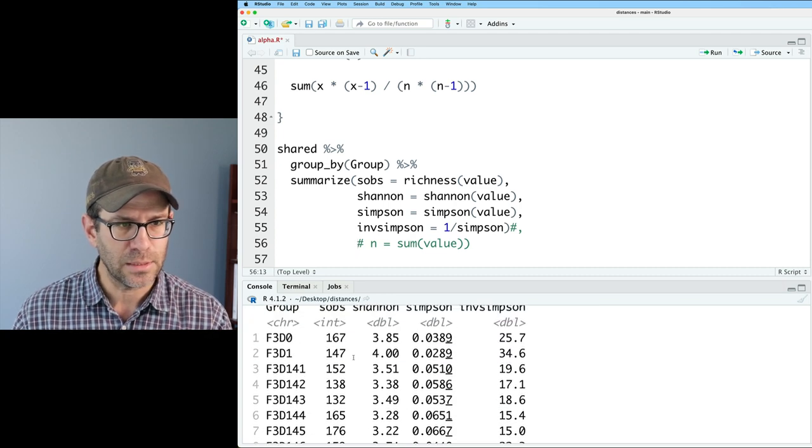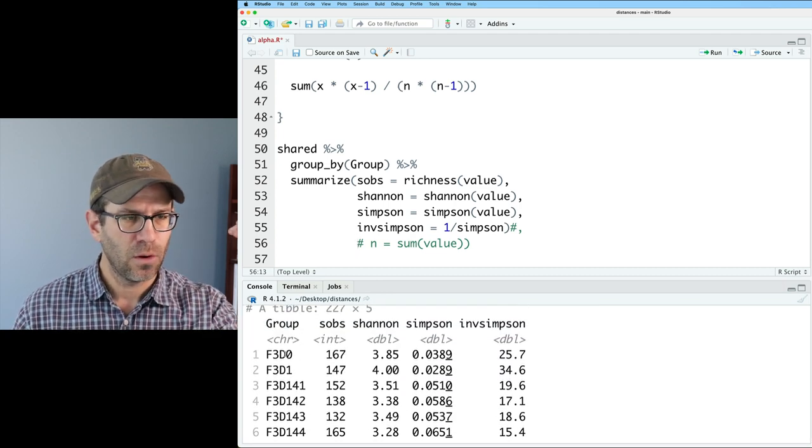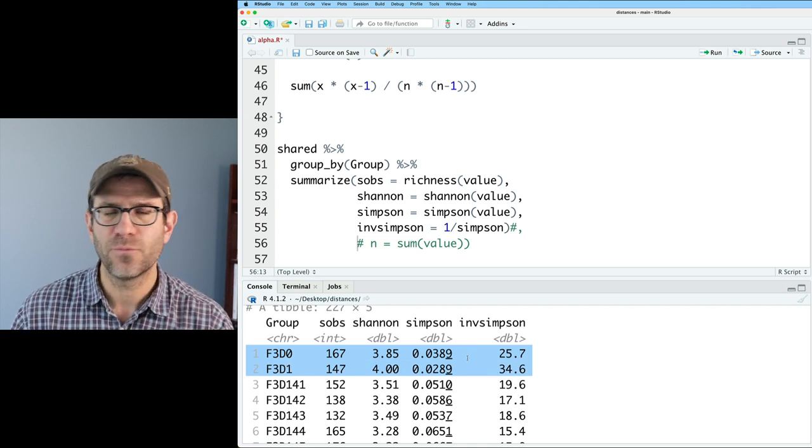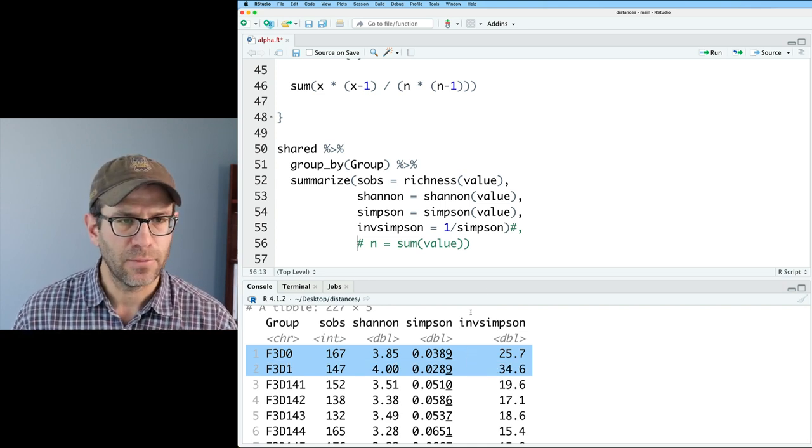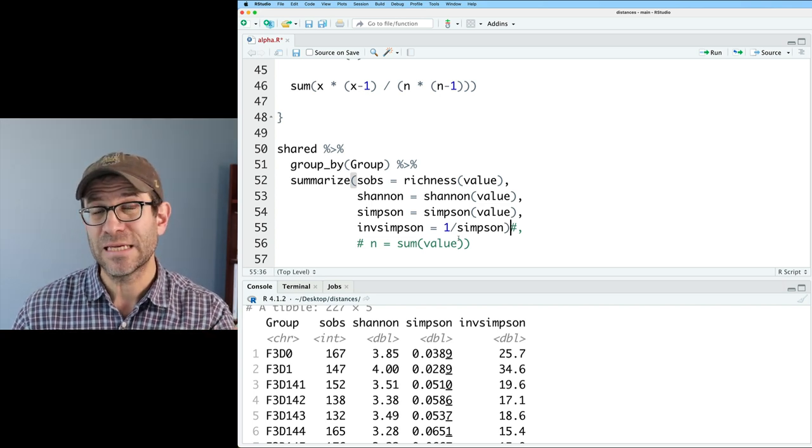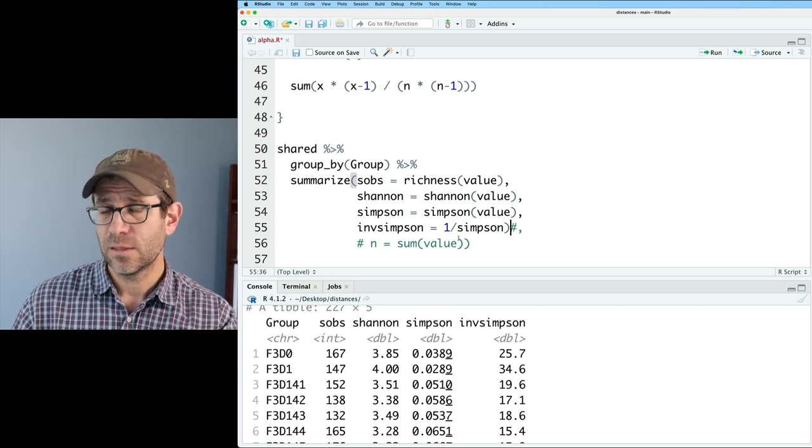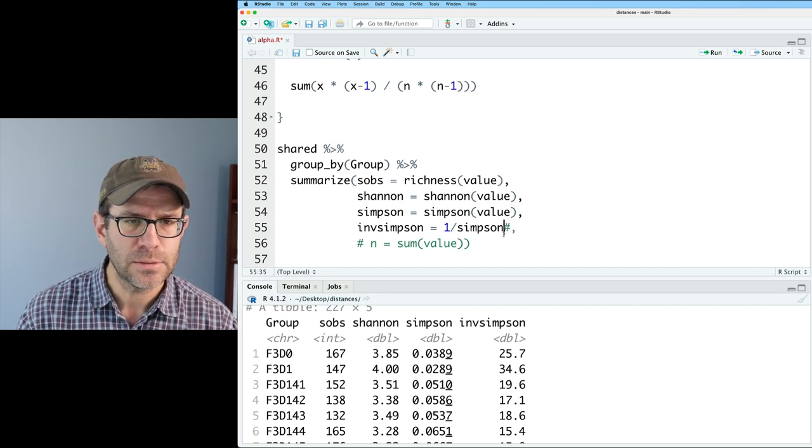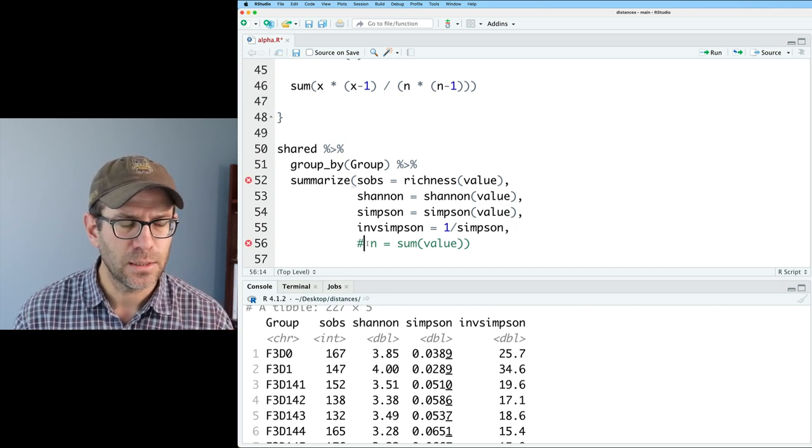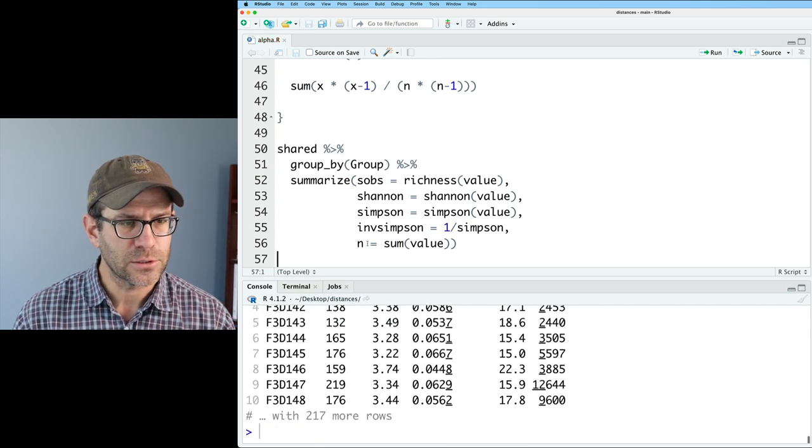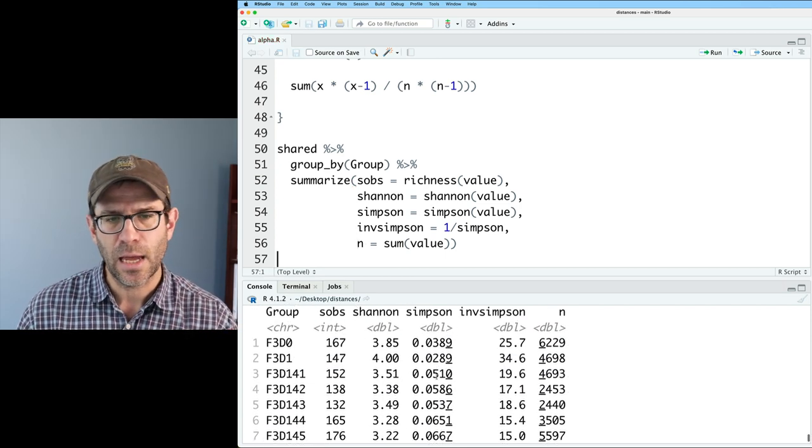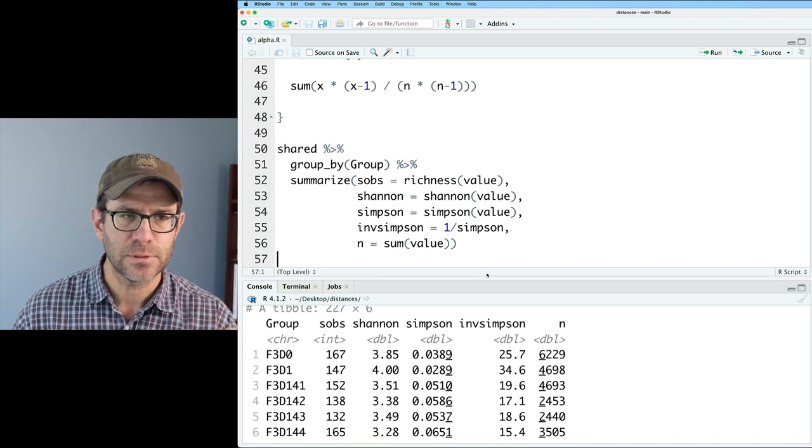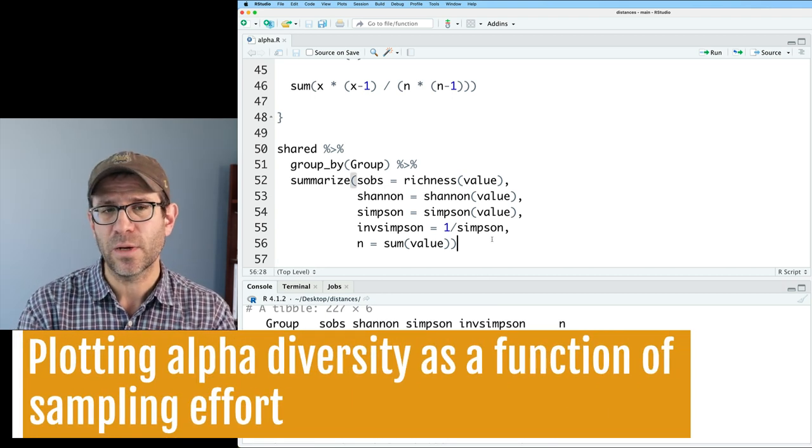And we see that we then have one row per group, we have the four different diversity metrics. And that looks good. I now want to bring in a column to indicate the total number of sequences, the number of individuals we sampled from each of our communities. So I'll go ahead and remove that parentheses and that pound sign and get that n in there. I think that looks good. And now we have the number of individuals in each of our samples.